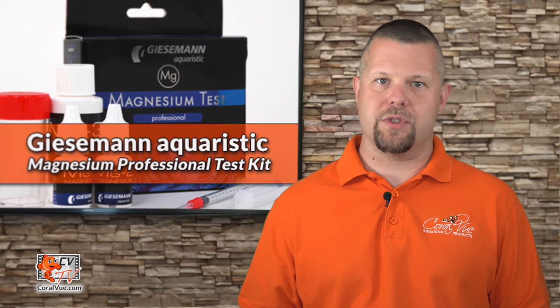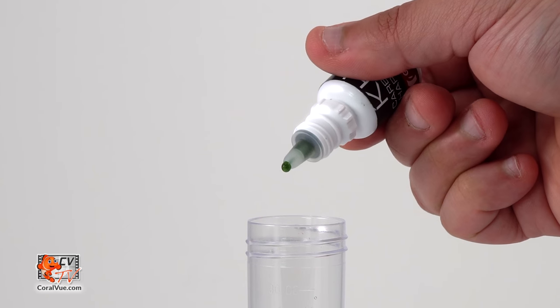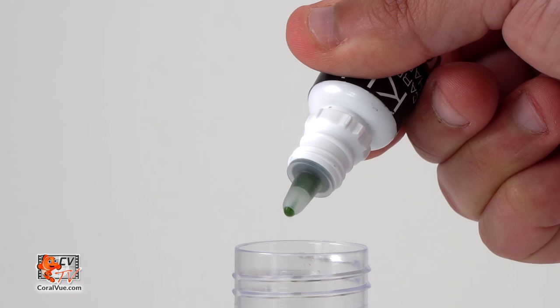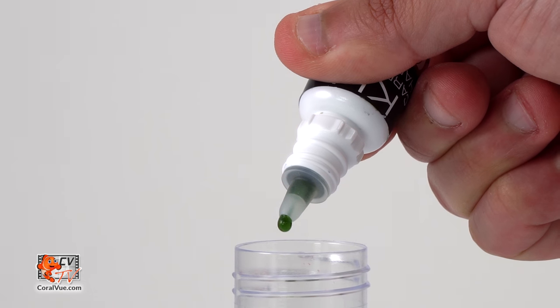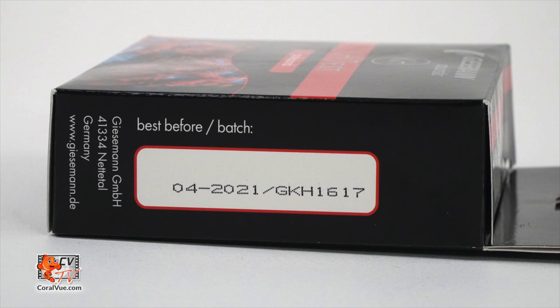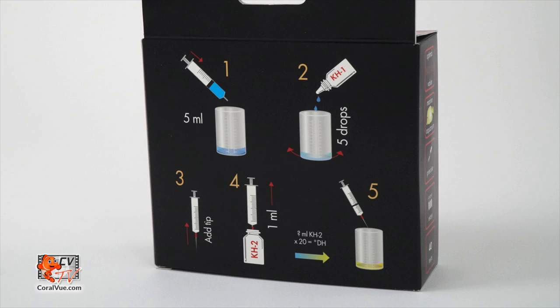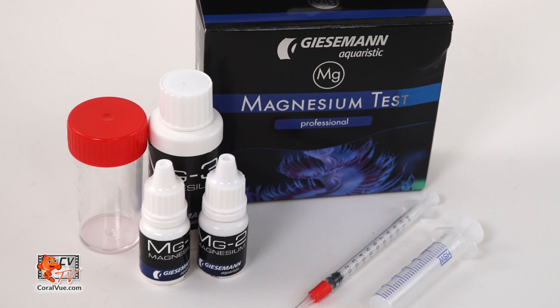All Giesemann test kits feature calibrated droppers to ensure that every drop administered is exactly the same. You can do one, two, three, four times a test and the results will be the same. All test kits feature a clearly printed expiration date and lot number. All Giesemann test kits include multi-language illustrated instructions and professionally calibrated color charts. The Giesemann magnesium test kit offers an uncomplicated, fast, and precise measurement of magnesium concentration in salt water aquariums.